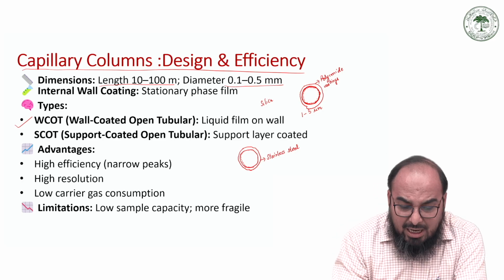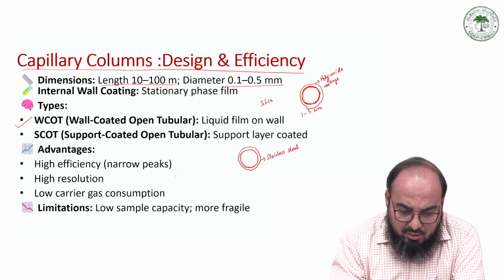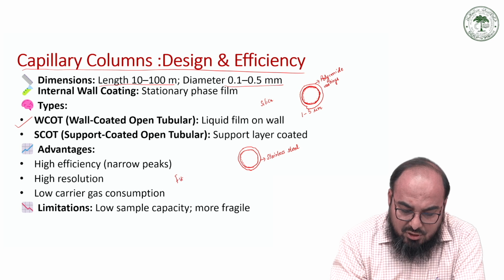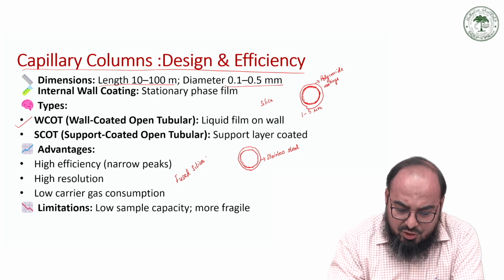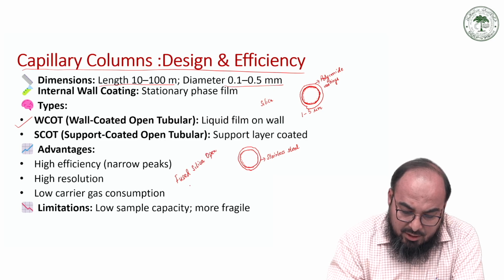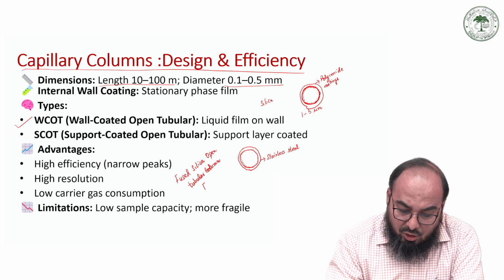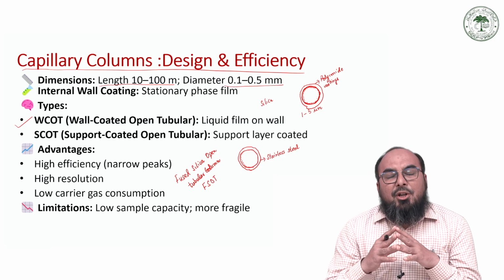Nowadays a new type of tubular column has also emerged, that is called the fused silica open tubular column, that is called FSOT.